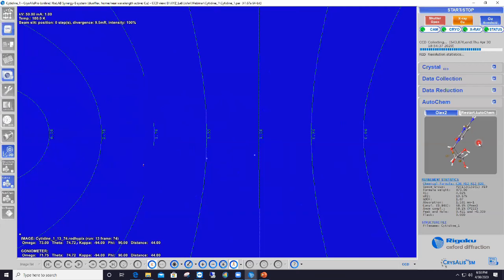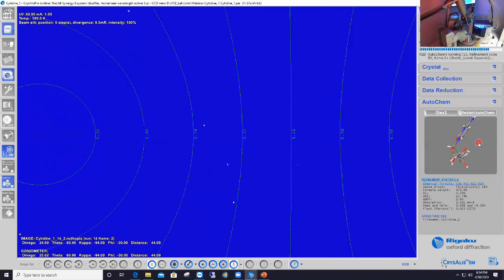Okay, yeah. Could you tell me something about that detector you have there? I mean, we have the Eiger, but on this one, I don't see any banding at all, and it's a lot wider, right? Correct. You have all that fancy blue lights on the top of it too. Go for it, Joe. Sure.